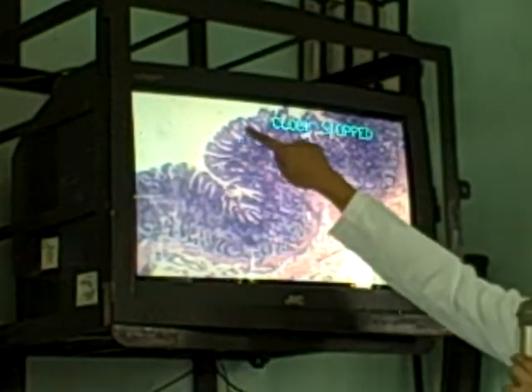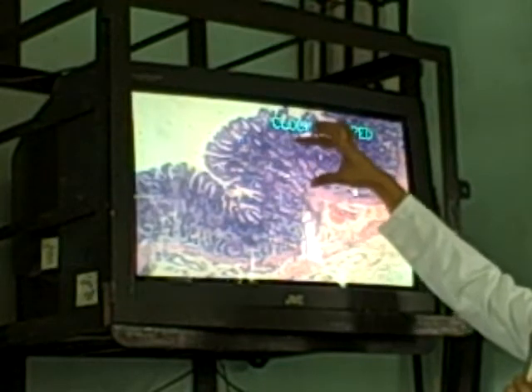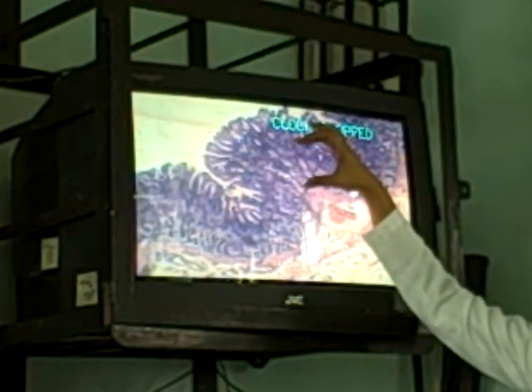Because you have to identify, aside from the layers, of course, the characteristic cell. But you have seen this before, right? Or the submucosa, which is made up of dense irregular collagenous tissue. So this is, again, mucosa. You have three sublayers. You have the lining epithelium, and then this one is lamina propria, but it is occupied by gastric glands.